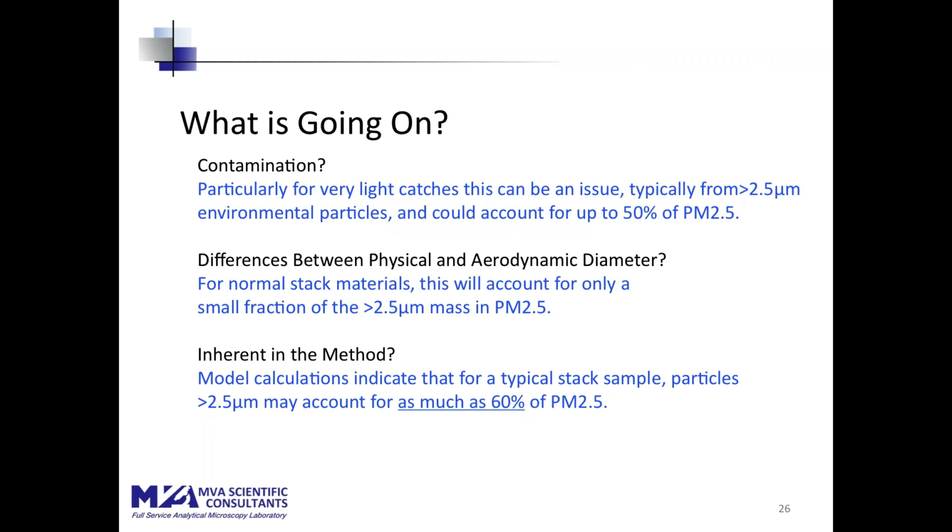Could it be the differences between physical and aerodynamic diameter? For normal stack materials, as we showed here, it's not a significant difference. The change from physical to aerodynamic diameter does not have a big effect on PM2.5. And in some cases, when you calculate the aerodynamic diameter, you end up with a lower mass in PM2.5 than you did when you just used the physical or geometric diameter.